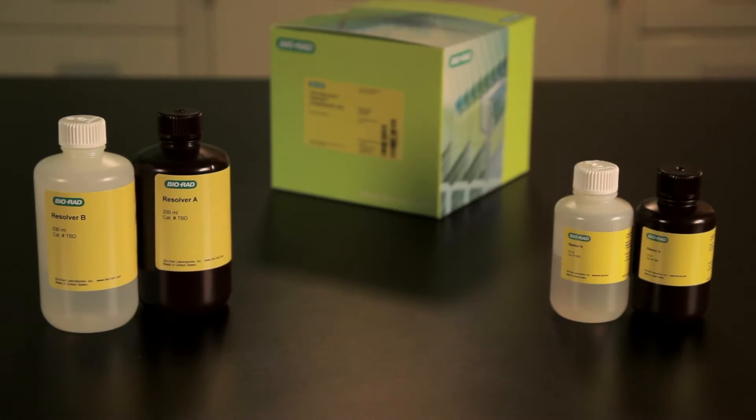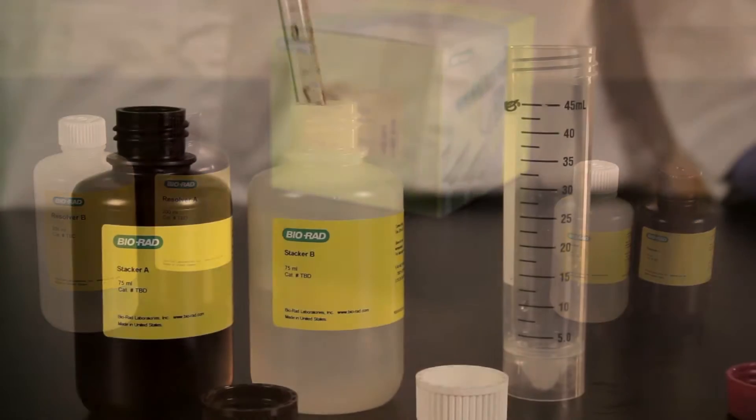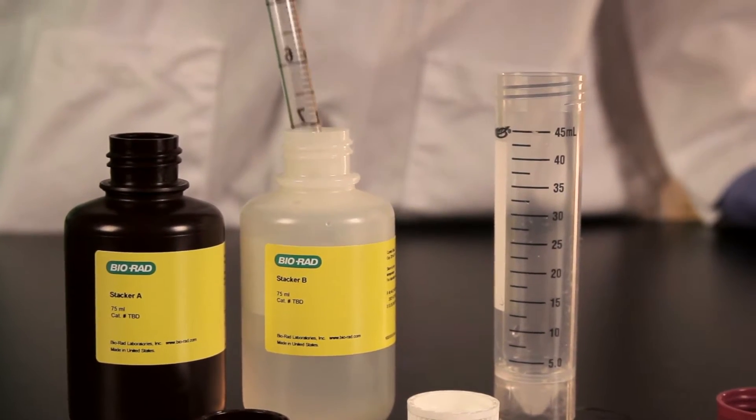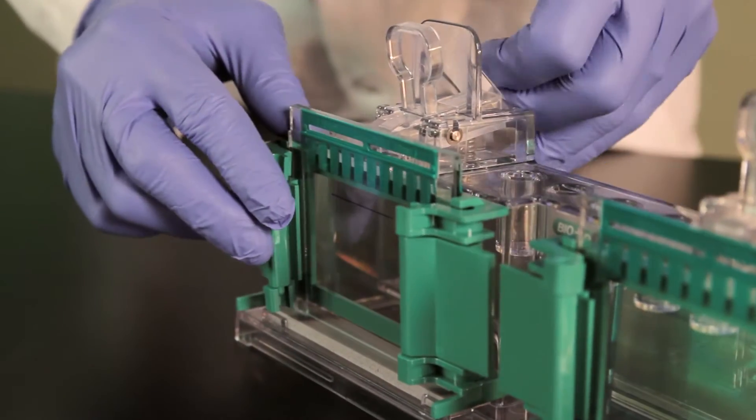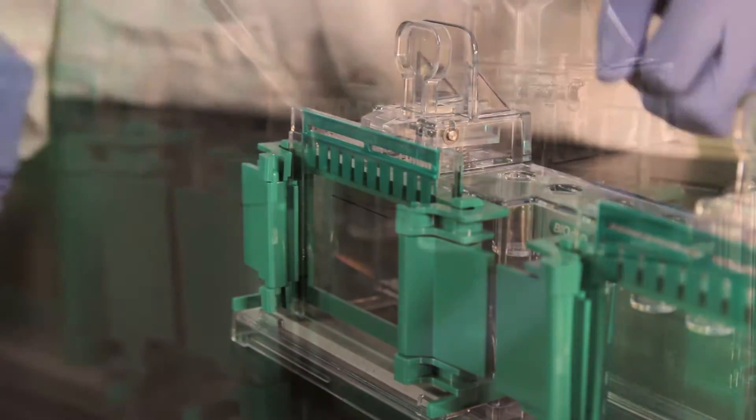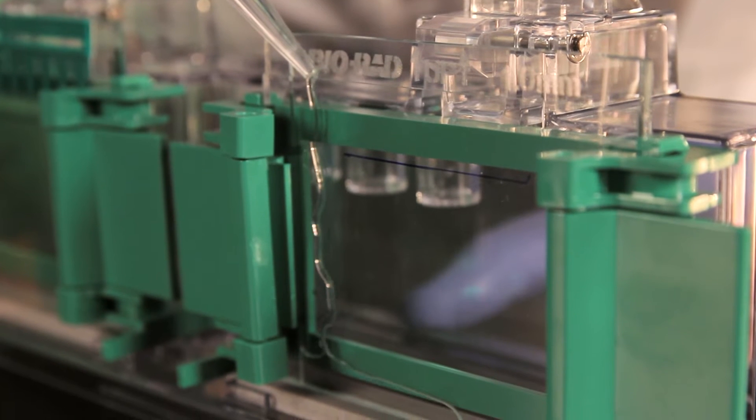TGX and TGX Stain Free Precast Gels are fast and convenient, but did you know you can also hand cast your own? TGX Stain Free Fast Cast Kits make gel casting easy, can be run in as little as 20 minutes, and provide superior transfer efficiency. Stain Free Fast Cast Gels last up to one month and can be visualized in five minutes or less without staining. So let's go pour some gels.